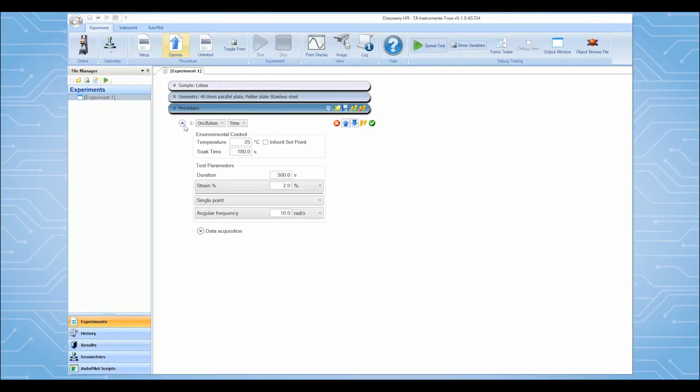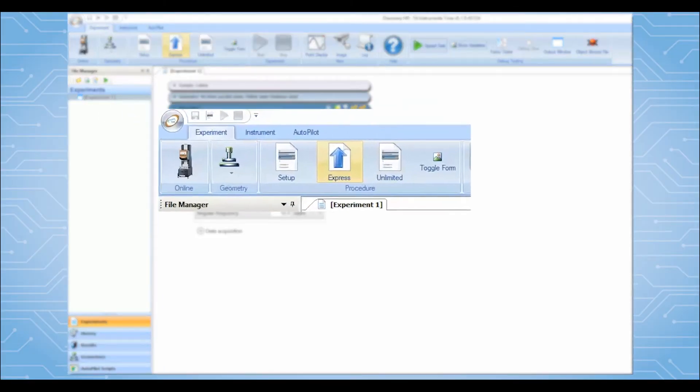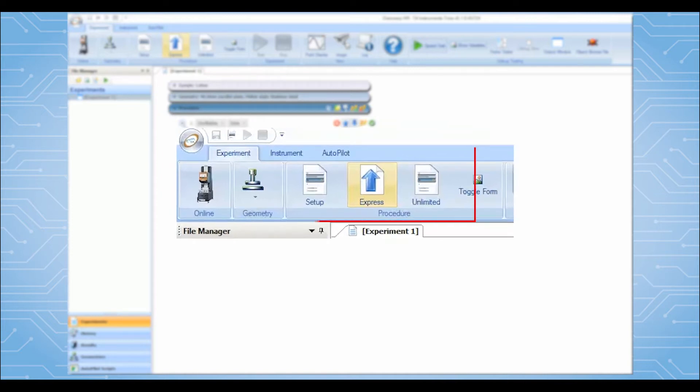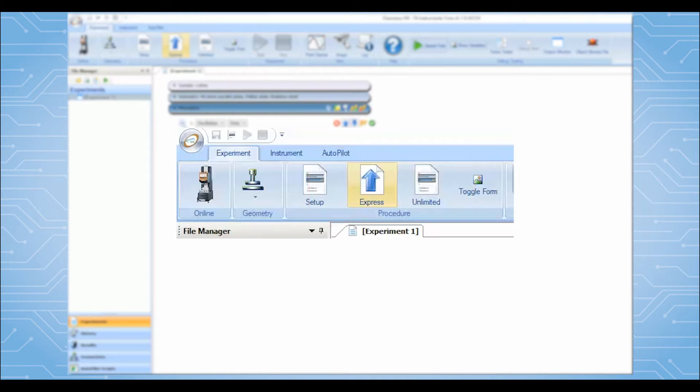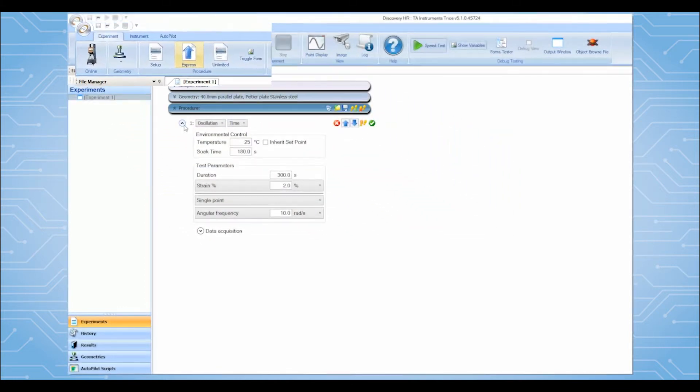TRIO's software contains two unique test setup interfaces: TRIO's Express and TRIO's Unlimited. Users can easily switch between the two interfaces using the icons on the top ribbon.